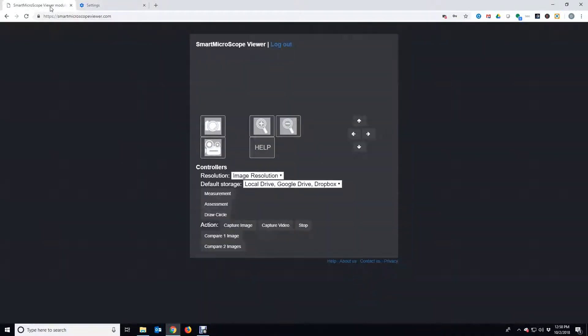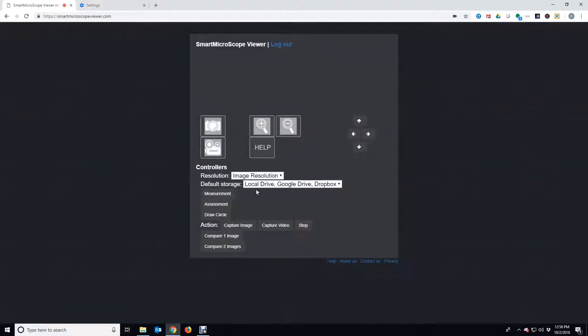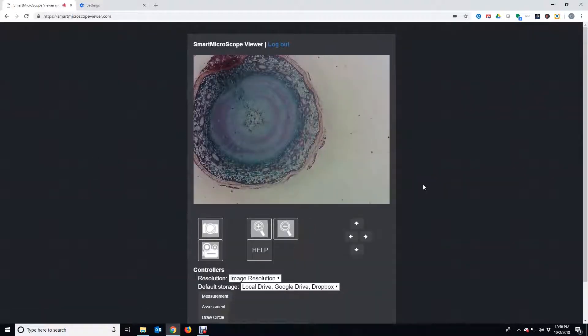Go back to the first tab and refresh the page. You now see the live image from the Smart Microscope.